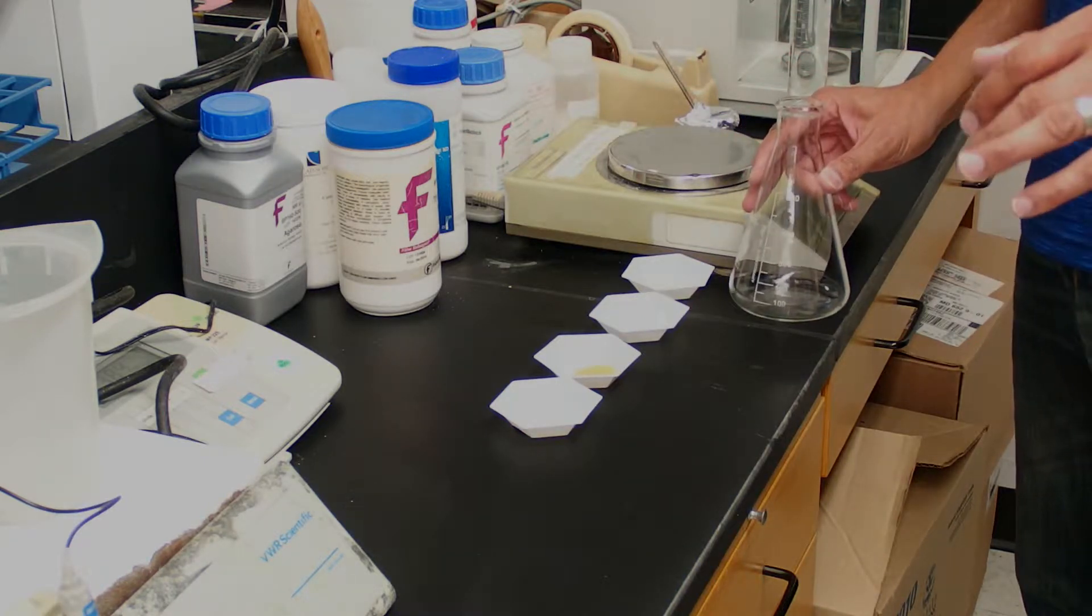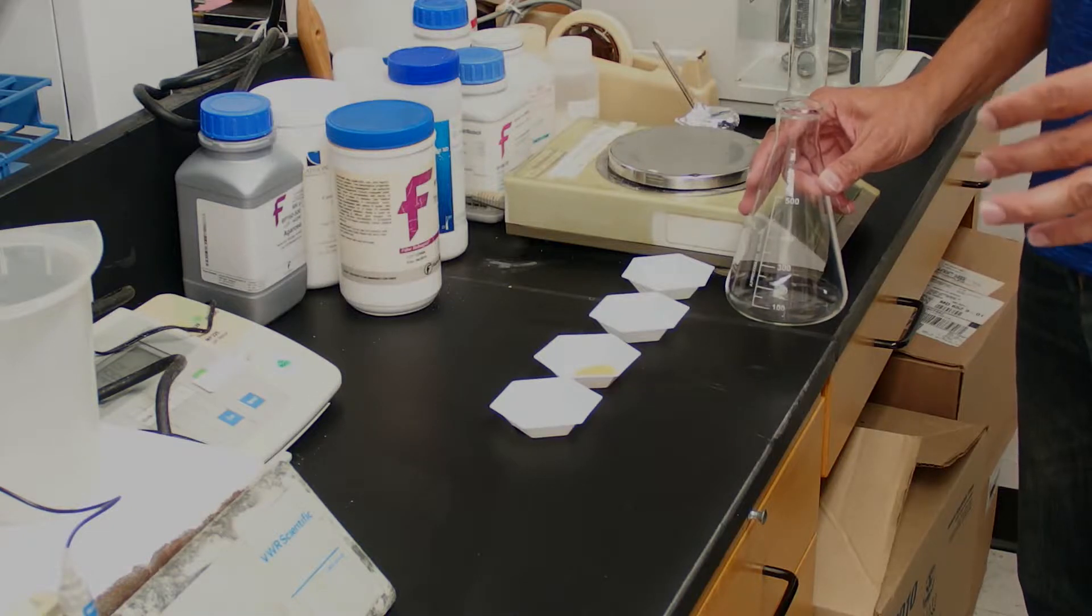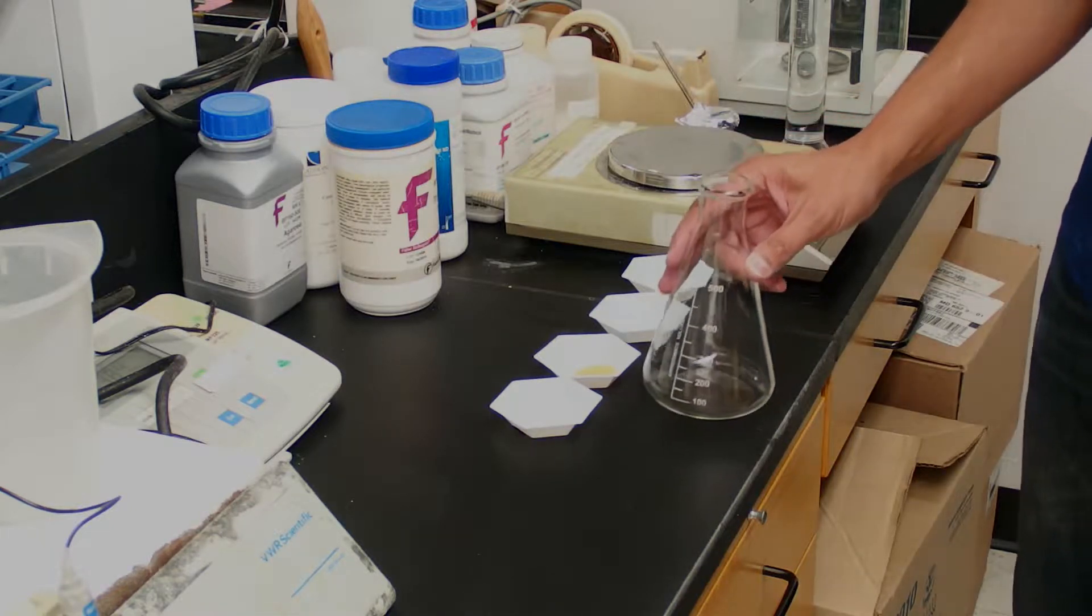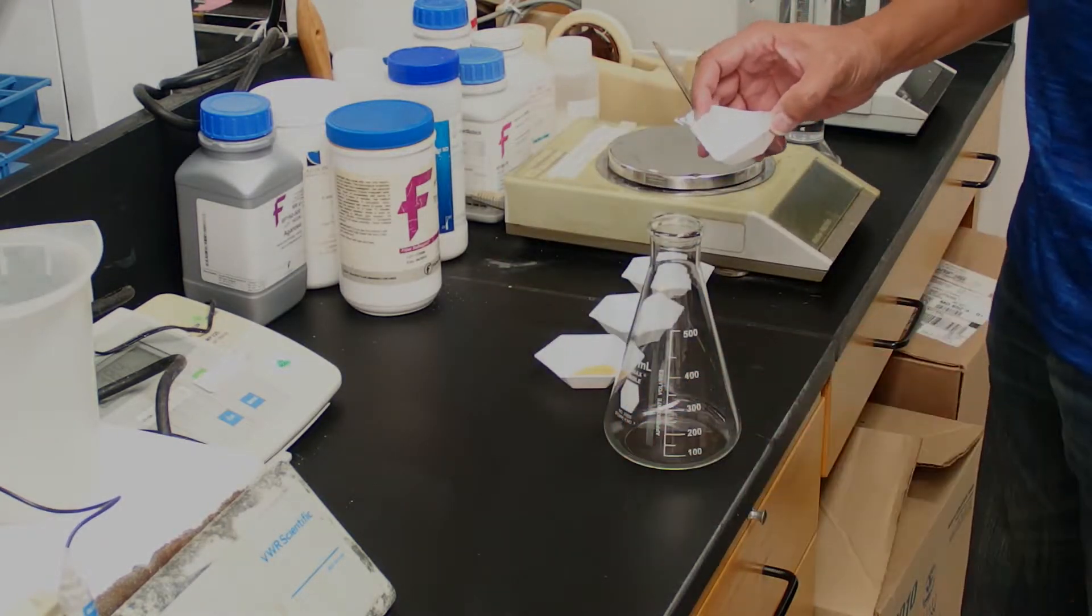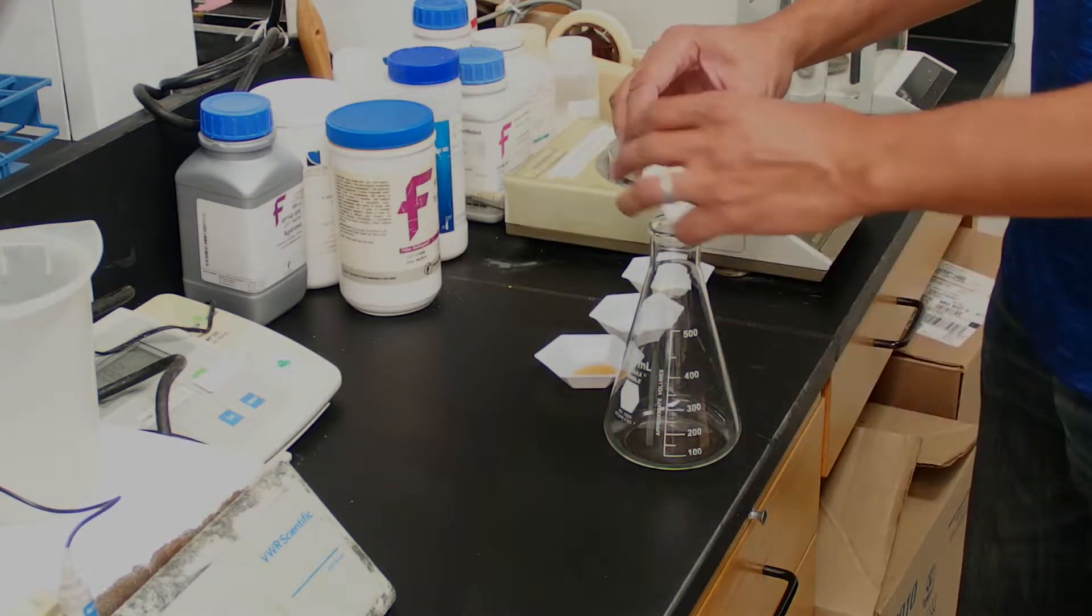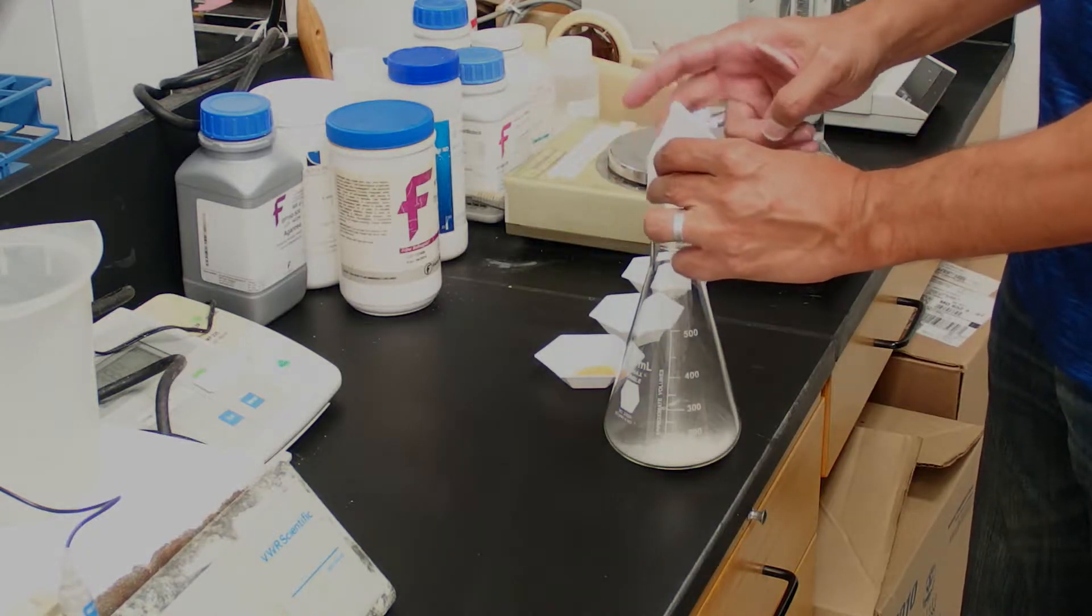Here we're making the easiest possible LB agar that you can make. So we're just going to weigh these things out, add them to a flask. I'm going to make 200 milliliters of LB agar. I'll just pour that into the flask.